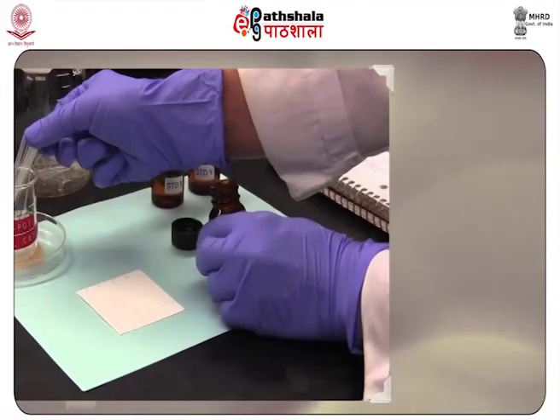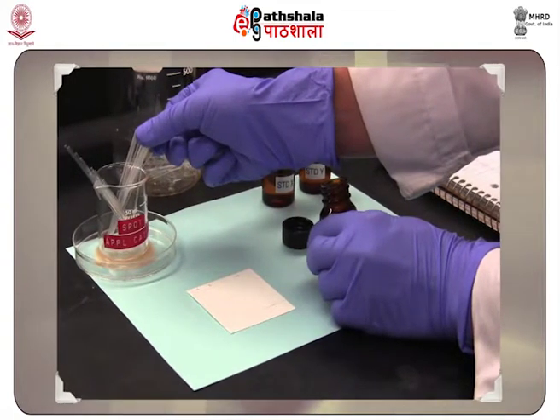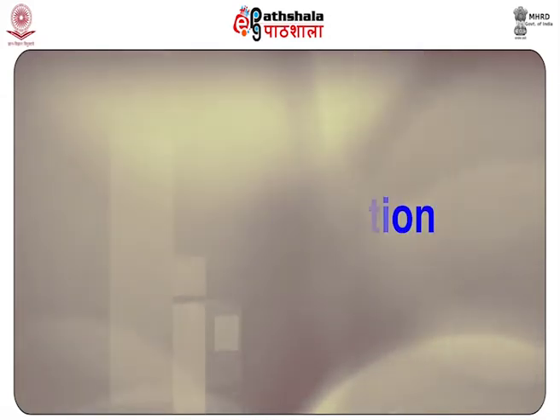After applying the sample on the plate, the mobile phase, made up of one or more solvents, is drawn up the plate through capillary action. As different analytes have their own characteristic speed of migration, they get separated on this basis. Now, about the plate preparation.